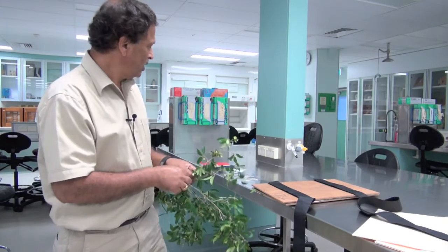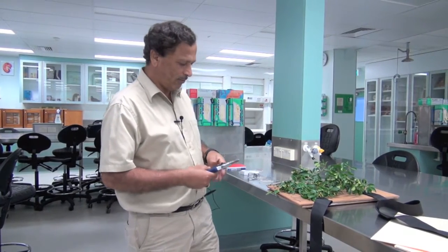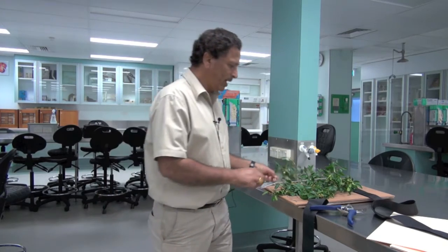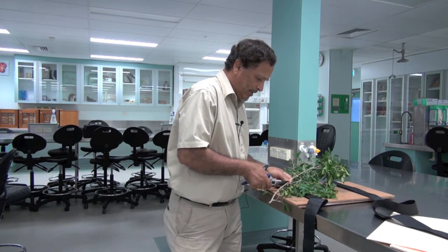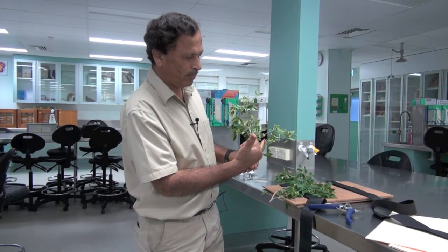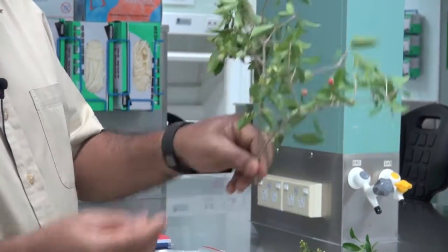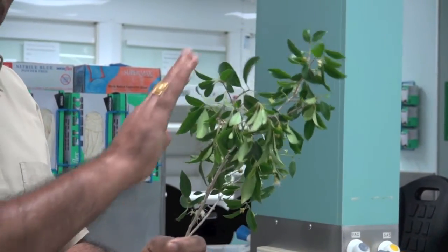Once you collect it, select the best branch you can find with all the requirements. It should be somewhere of this size or slightly longer possibly. You can see that this branch has got the fruits, the older flowers, the younger ones just blooming, and also the buds. So this is an ideal branch to be selected for collection because it has got all the stages.